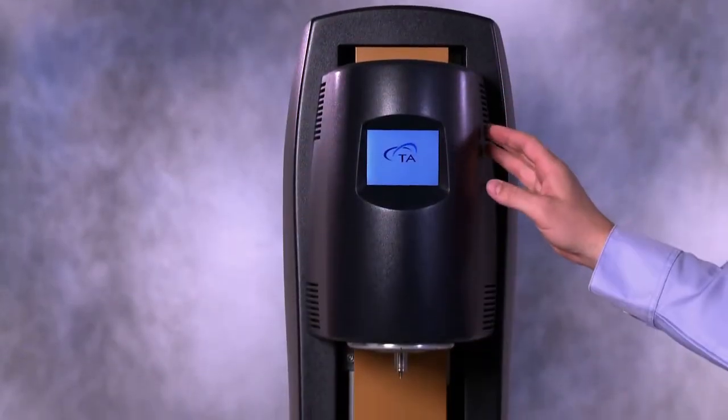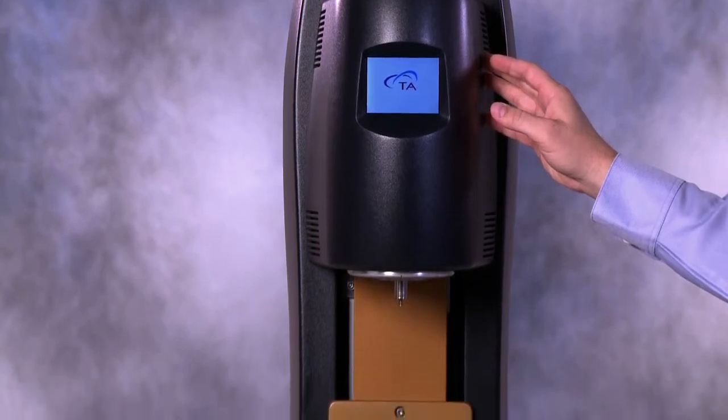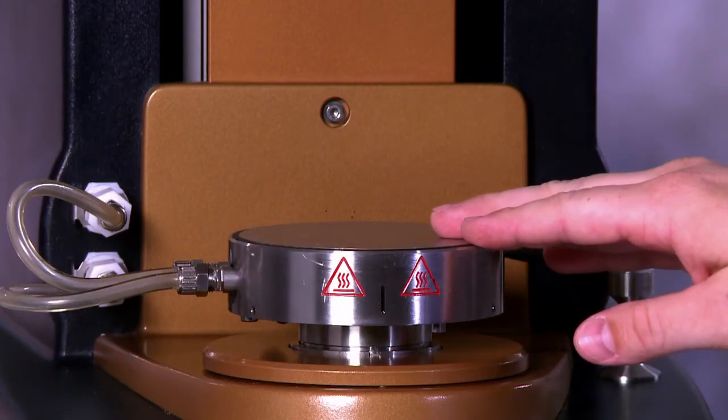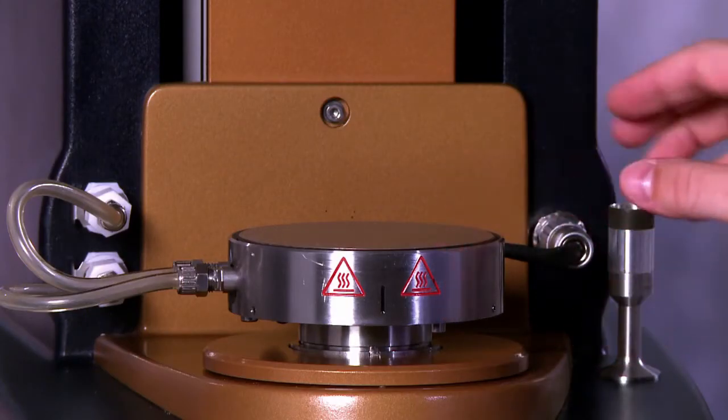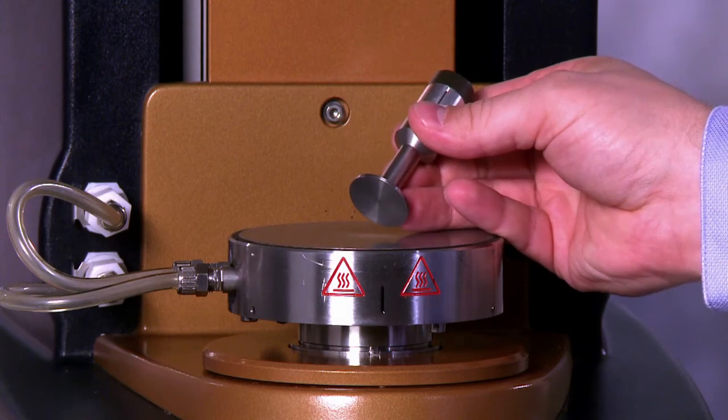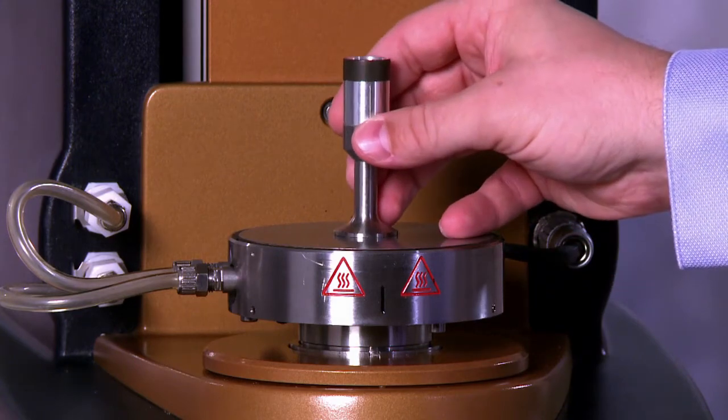Here we have a DHR instrument that has previously been calibrated for instrument inertia, and now we're going to calibrate using a Peltier plate and a 25mm stainless steel parallel plate.